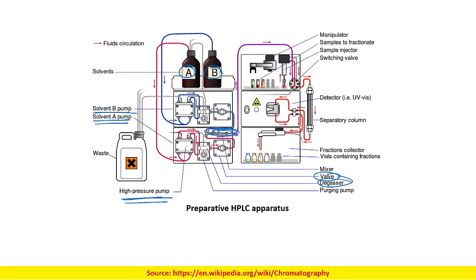And why do you want this gradation? Because if you are having water in higher quantity, the hydrophilicity of your solvent will be higher. If you are having methanol in larger extent, comparatively the hydrophobicity of your solvent will be higher. Okay. So this will affect the partition coefficient of your solutes.